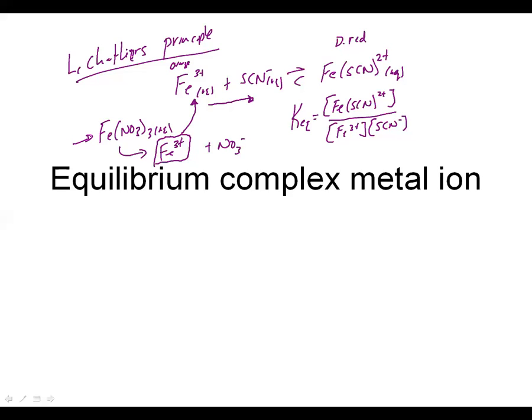So for example, I won't do too many of these examples because I'll probably do the right ones. I'm just going to do it randomly, like if I added A, B to this, this is a source of A and B. And if I look at A and B and it's not anybody in this reaction, but I did see something occur, what that must mean is either A or B is reacting with somebody in this reaction and perhaps making a precipitate and removing something. So those are things you want to look for when you're doing the Le Chatelier's principle part.